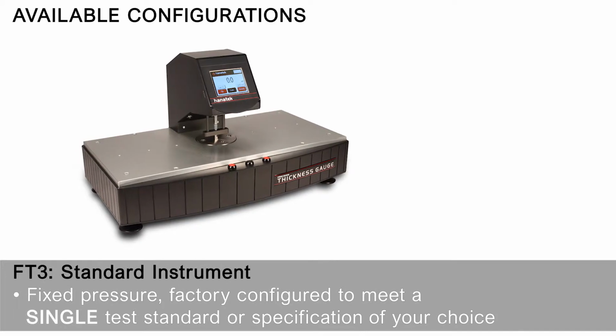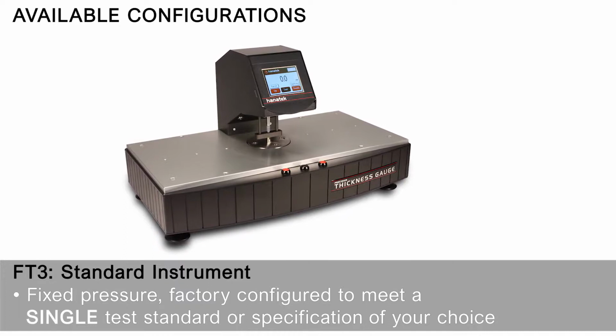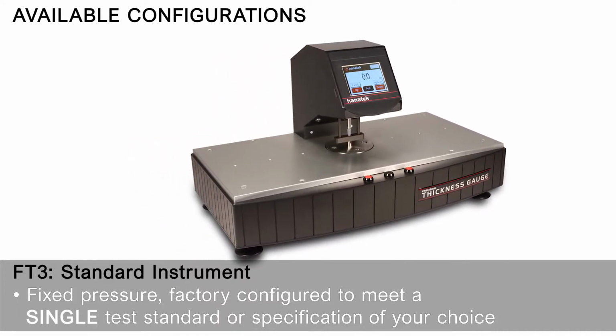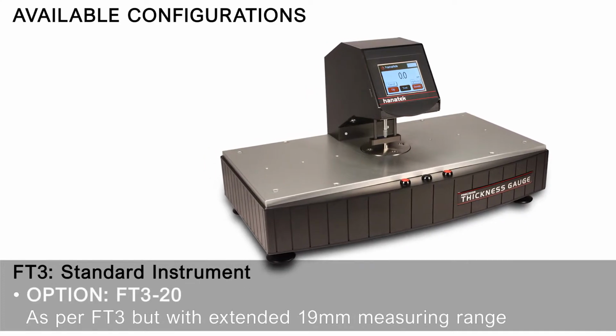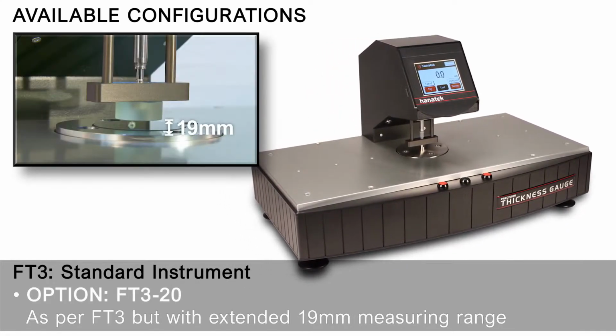Available configurations. FT3 standard instrument. Fixed pressure, factory configured to meet a single test standard or specification of your choice. Option: FT320, as per FT3 but with extended 19mm measuring range.